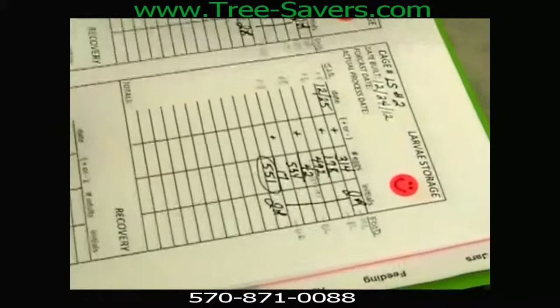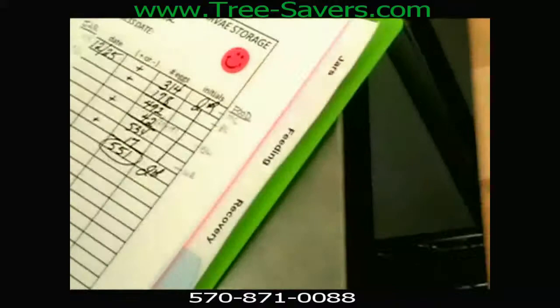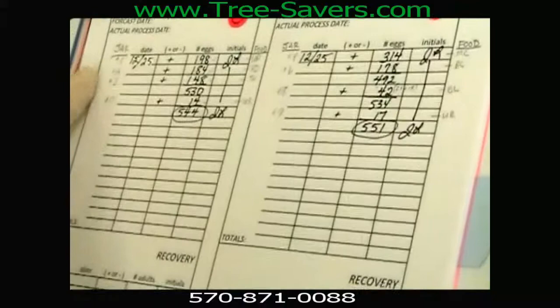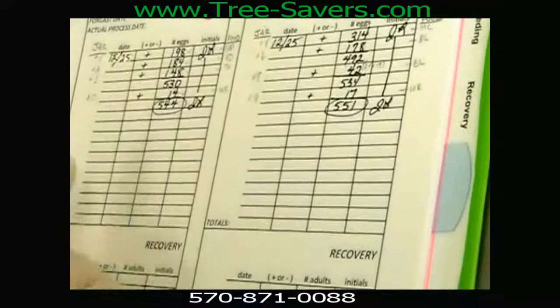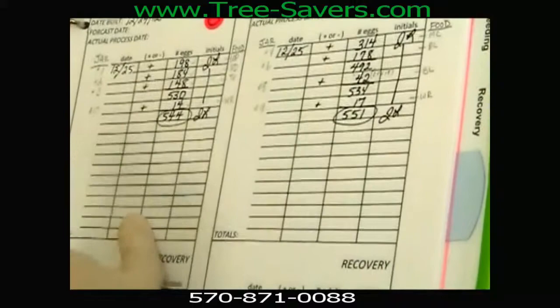When we get those gauze pieces out, we come in here and add them into a rearing cage. I'll show you a picture of one of those before we end. Here we have jar number one, jar number two, jar number three. I distinguish where the gauze or the branches came from and put the food source noted here. So if we ever open up a box and we don't get 500 adult beetles, we can go back and see if there was a contaminated food source, who did the jar, and be able to narrow things down.